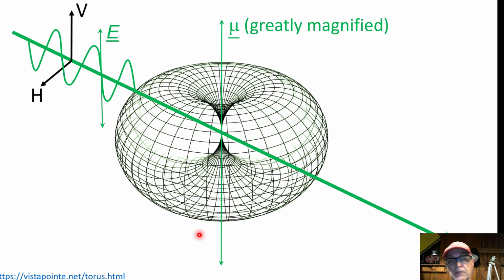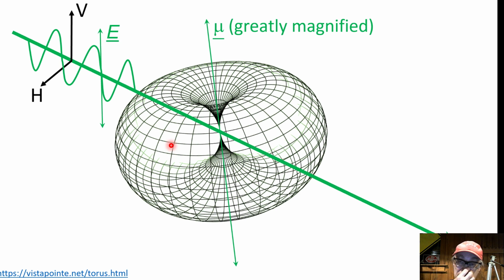This is what goes on, going all the way back to our study of static light scattering. If I have a laser beam and a point scatterer here, it sets up this sort of donut-like radiation pattern. That's what happens for most objects that have no optical anisotropy. But there are objects that do have optical anisotropy, and what they do is they kind of rotate the response and produce a little bit of depolarized scattering.